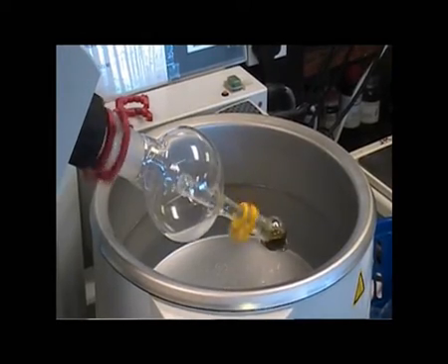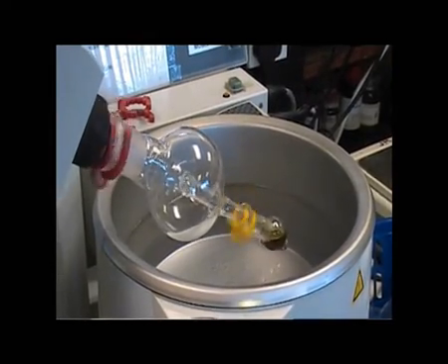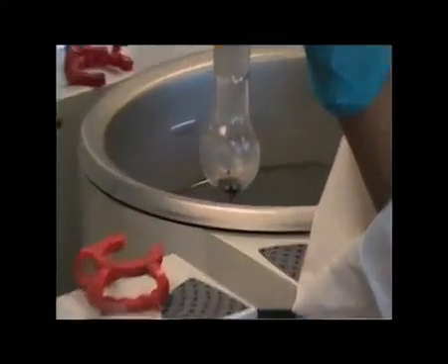The solvents are removed on the rotary evaporator to yield the product.